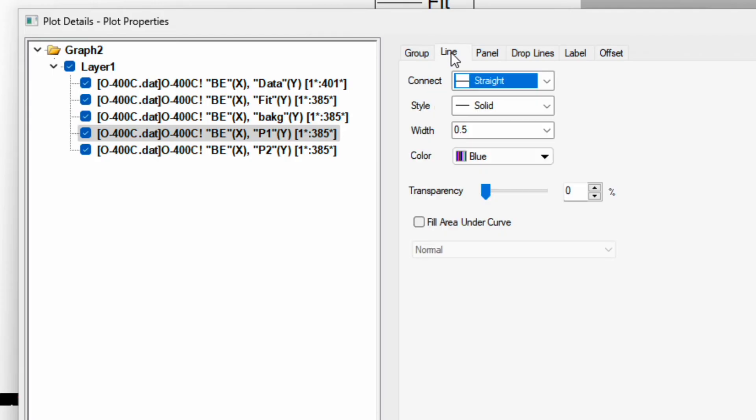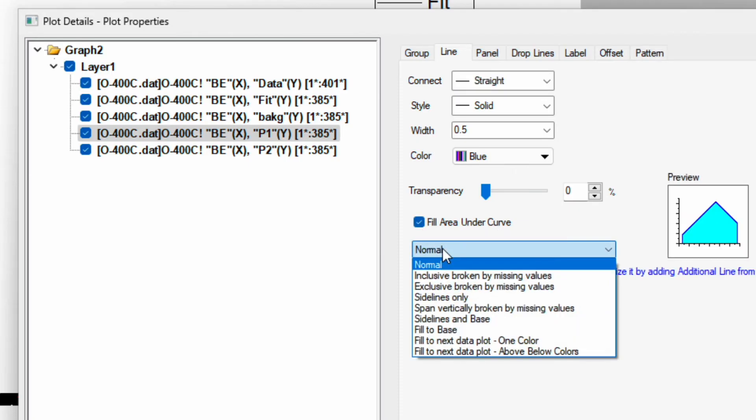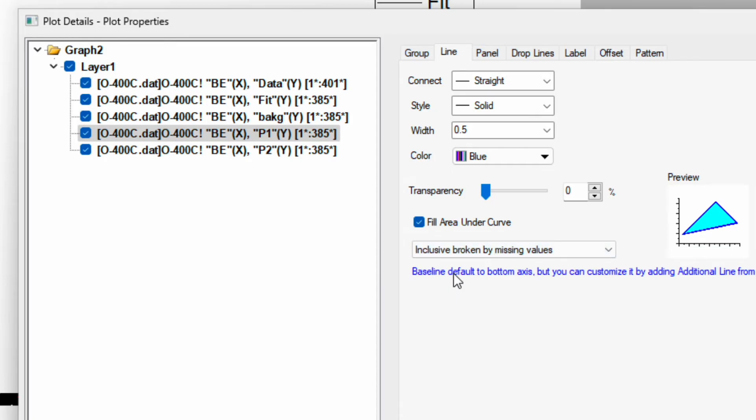Now you can go to the line. Over here you can find option for the fill area under the curve, so check this box. Change from normal to second option, inclusive broken by missing value, then apply.